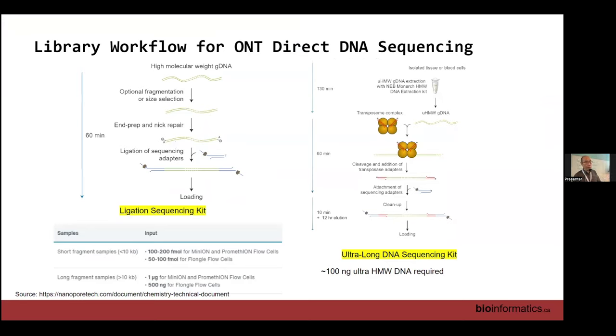And they also have adapted protocols that let you go extra long. It's kind of like a marathon, where labs race to see who gets the longest DNA sequencing. They usually run around 72 hours for each sample.